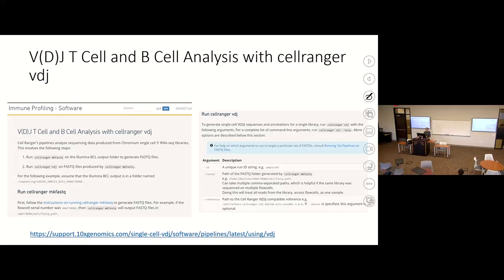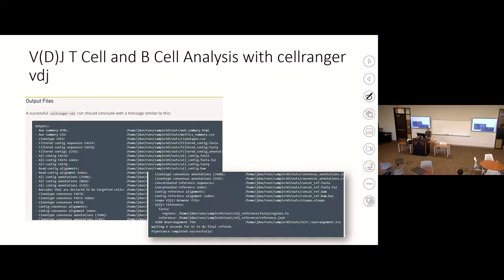The downstream process is also different. With Cell Ranger, if you have this repertoire analysis, you generate the data from this VDJ receptor sequence enriched library. Then you have to use the Cell Ranger VDJ specific command line. This run will give you different results, which you don't normally see from the typical single-cell RNA-seq expression results.